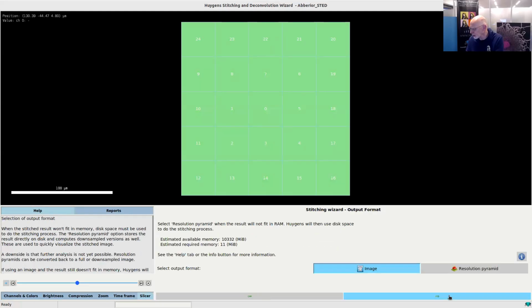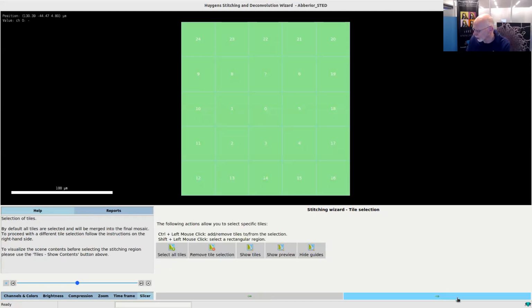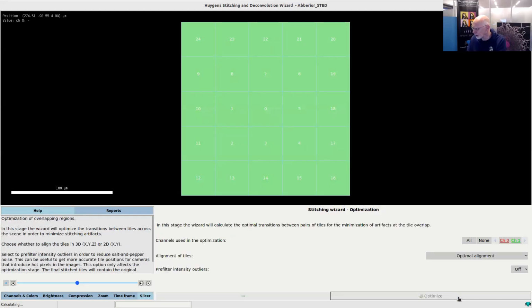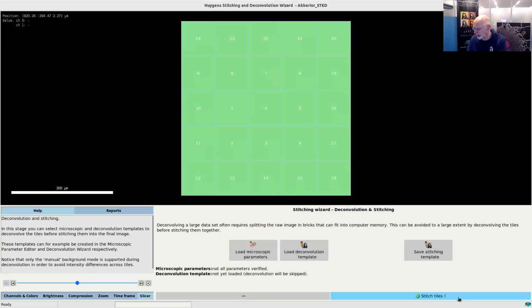I'm not going to explain all the steps. My colleague Melvin did a wonderful job in explaining that in the previous webinar. So I welcome you to have a look at that stitching webinar. It's recorded and on our website. And if we just continue, we stitch all these tiles together.